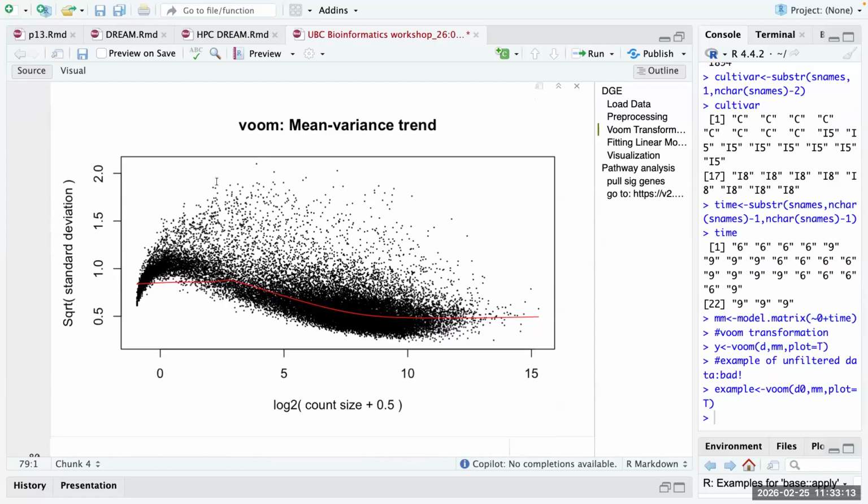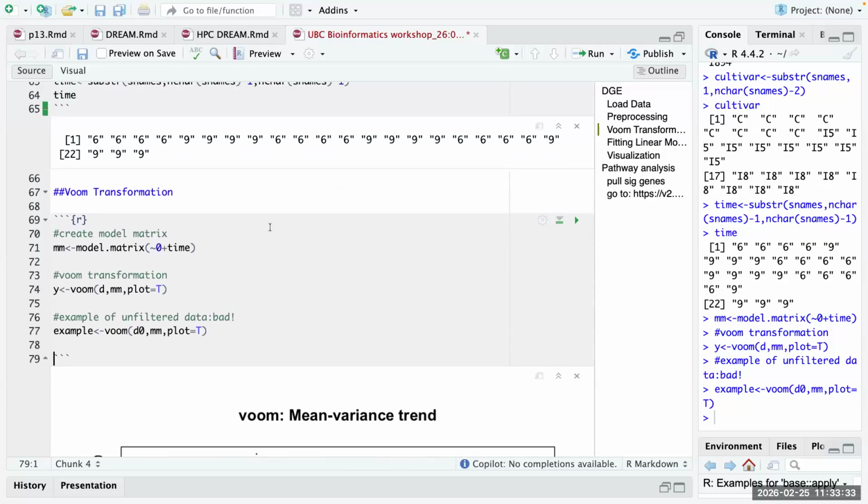Do we have questions so far? I have a question. I think it's about the column names on the side. I don't get why numbers like time and replicate are there. Is it just a name? I don't get that data.